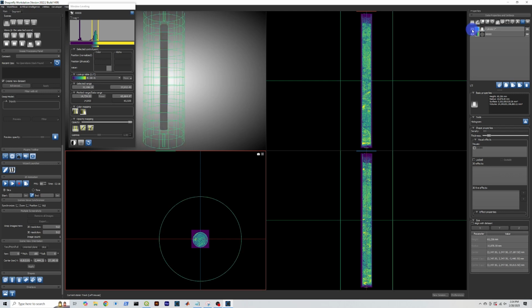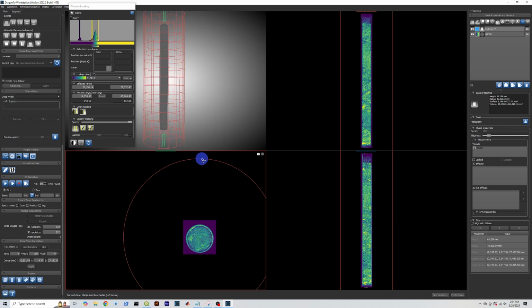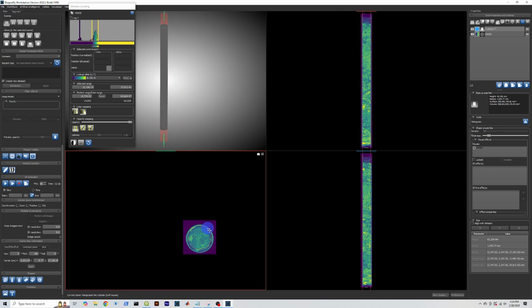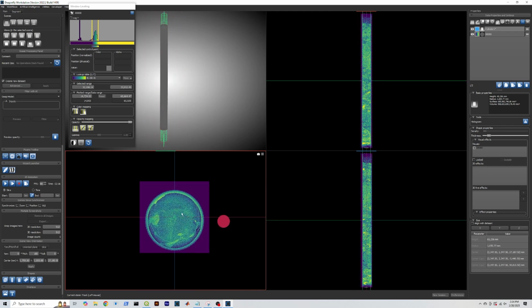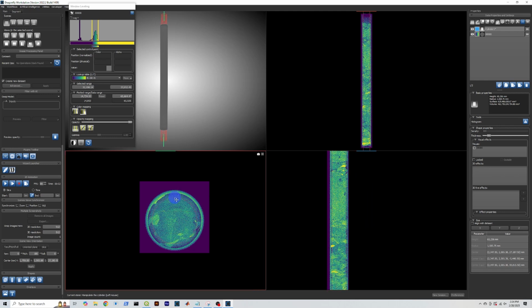That is our cylinder. And we're going to make the cylinder just big enough to look at the mud. Where we're going with this is we're going to clip out the PVC barrel on the outside. You can see that right there. Okay, so now we have effectively a smaller radius cylinder inside. We're going to subcore our coring barrel digitally.